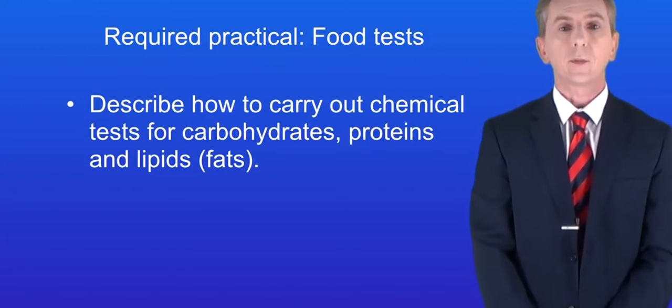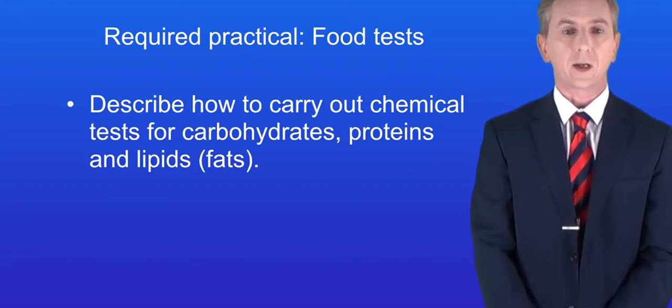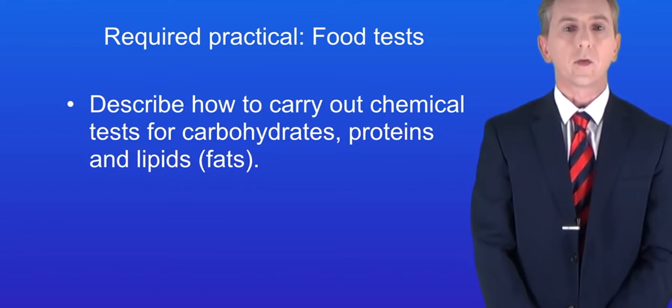By the end of this video, you should be able to describe how to carry out chemical tests for carbohydrates, proteins and lipids. And remember that lipids is another word for fats. Now, this is a required practical and it contains a lot of detail. It could come up in your exam, so it's really important that you learn this.